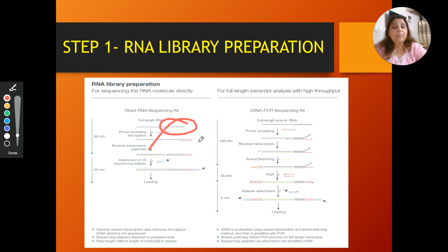Okay. Now we use this property of the RNA कि इसकी जो poly A tail है, poly adenylated जो tail है, हम उसके complementary poly T adapters बनाते हैं. ठीक है, उनको ligate कर देते हैं. अब ये जो poly T adapters हैं यहाँ पर, ठीक है, these poly T adapters help in the attachment of the sequencing adapter which contains the motor protein and the tether oligo.